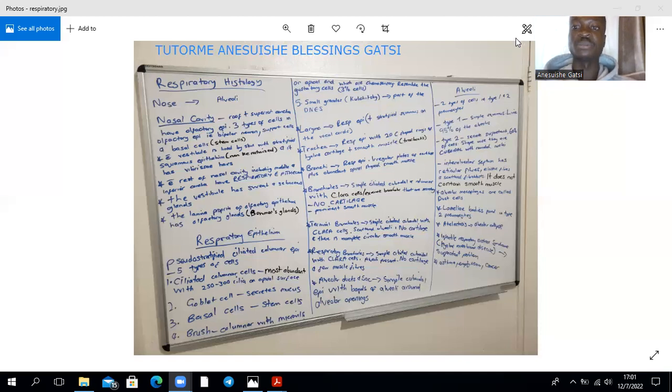Within these olfactory glands, you find lipofuscin, which is one of the pigments you find from general histology or cellular inclusions. This lipofuscin in the gland, as well as the lipofuscin granules in your supporting cells, are the ones that give the mucosa that yellowish brown coloration that I've been talking about, right?